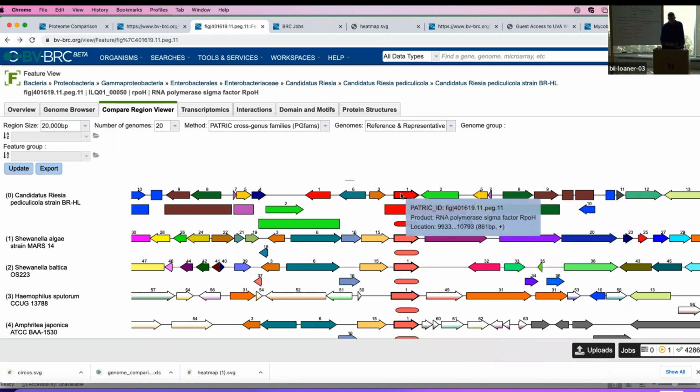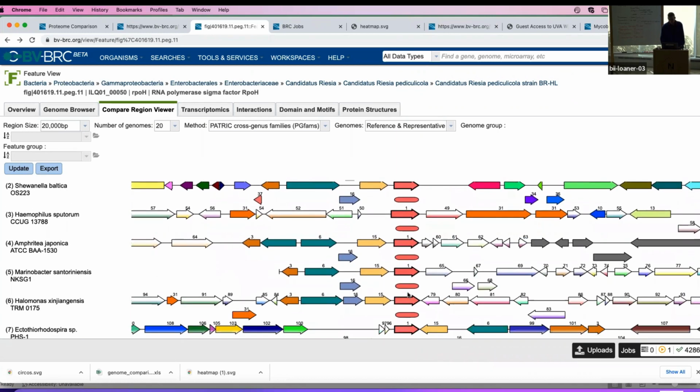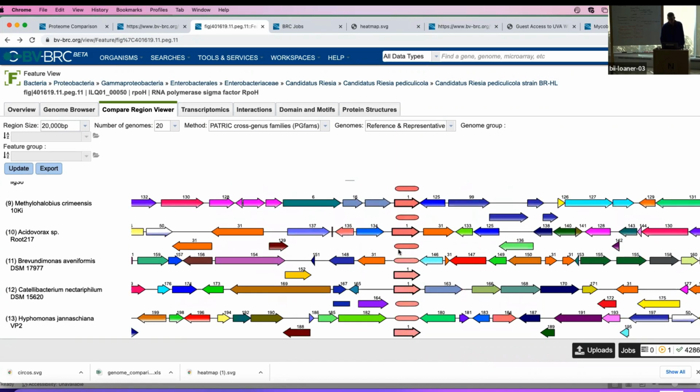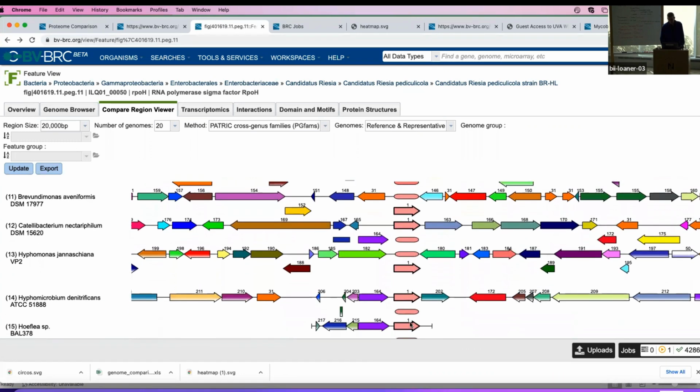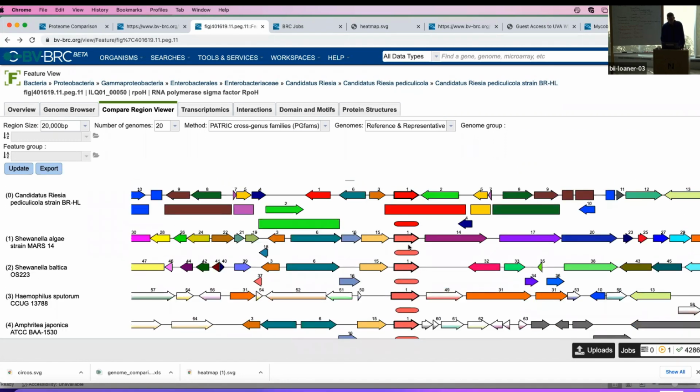So this base deep red is our focus, and we see these lighter reds mean that these are less strong BLAST hits. The length of the hit is sort of consistent across these. So the BLAST is hitting across the entire length of the corresponding features in this pin. So notice that we've got these little numbers here.